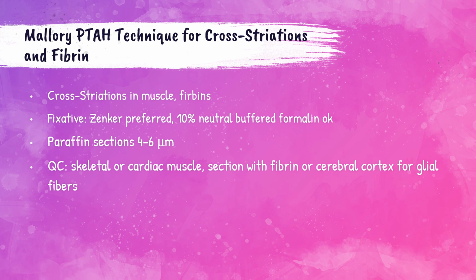A rhabdomyosarcoma is a type of cancer that occurs in the soft tissue. Nemaline rods also show up with this stain, and these Nemaline rods are present in certain skeletal muscle diseases. So this stain is referred to as a polychrome stain because it gives two prominent colors. Within this stain, tungsten from the phosphotungstic acid binds hematein, and this binding produces a blue-colored lake. And this lake stains specific tissue parts blue, and the phosphotungstic acid stains components red-brown in color.